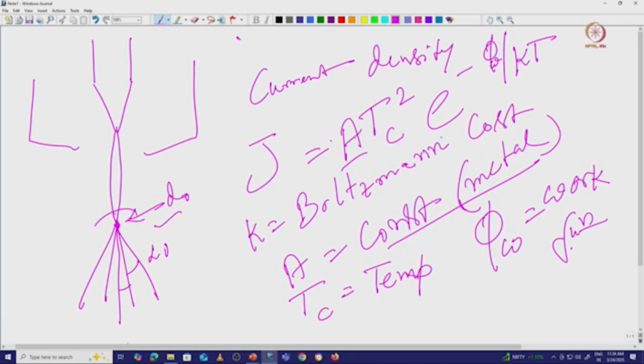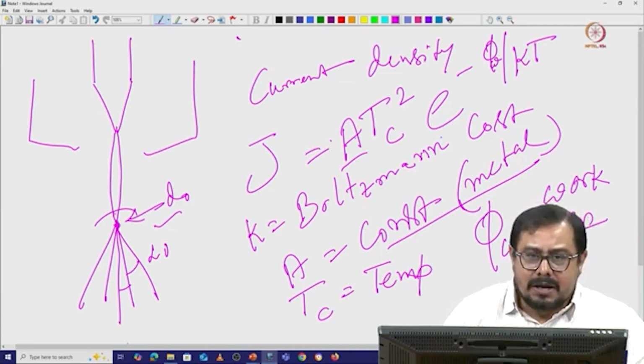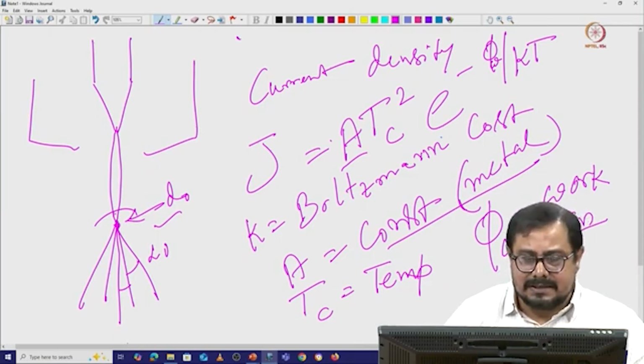Otherwise, most of the time we don't have to pay attention to these when we do imaging, but we have to know what kind of lens and filament we want to use. Do you want to use a LaB6 filament, a field emission gun or FEG? What is the difference between FEG and cold FEG, and between the tungsten filament and LaB6 or Schottky filament? Better to know those things before we use those instruments for our biological science samples.